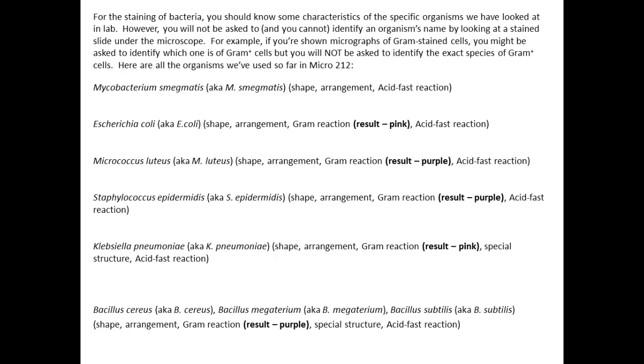By their genus name, what shape are they? They're rod-shaped, right? They're bacillus-shaped. I think all these guys form chains, so you could also say they're streptobacillus. And if you stain them, they would all be purple, so they're gram positive in the gram stain.